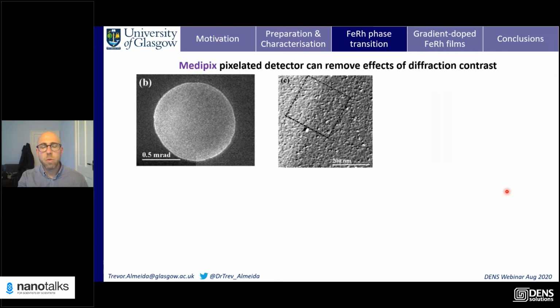So what we want to do is try and clean up these images because they're not particularly clear, they're quite noisy, and you get variations in intensity. If we look at an example of what the probe of the scan beam might look like in a polycrystalline film, we can see that it's not exactly flat. We've got variations, or non-uniformity, of the intensity within the probe. This is from an example of permalloy, which is polycrystalline, so we've got lots of little grains. So we'd have effects of diffraction contrast, deflecting the beam away from the optic axis.